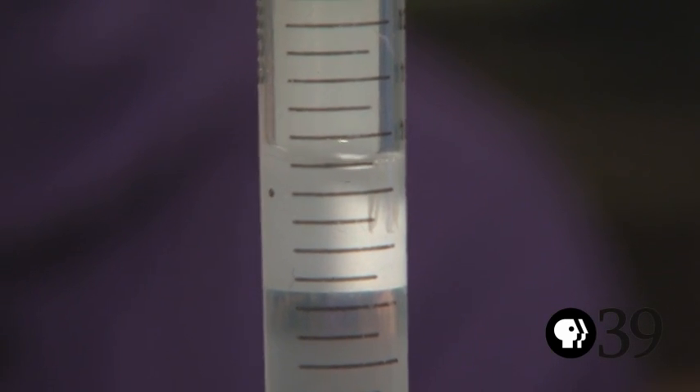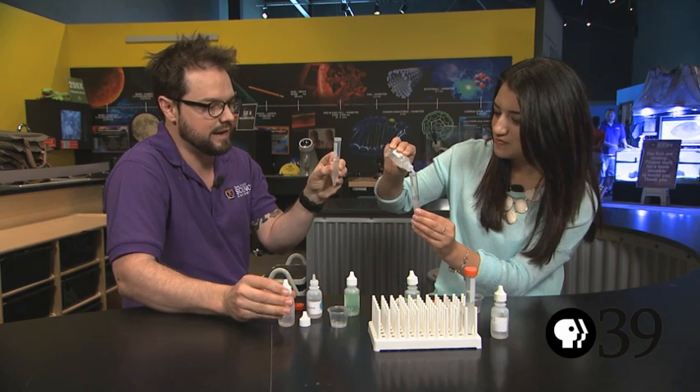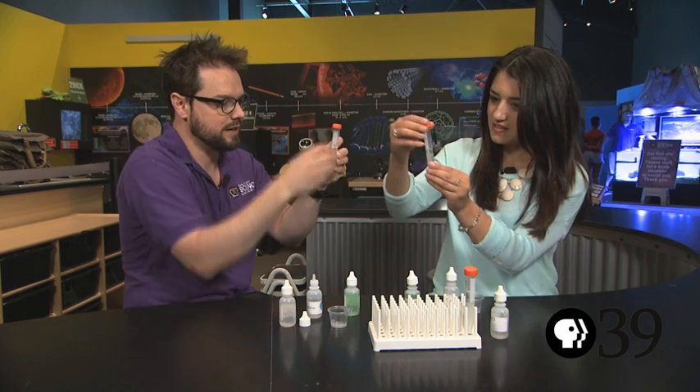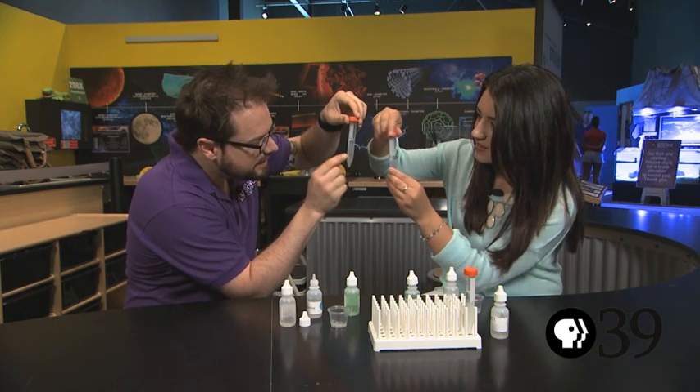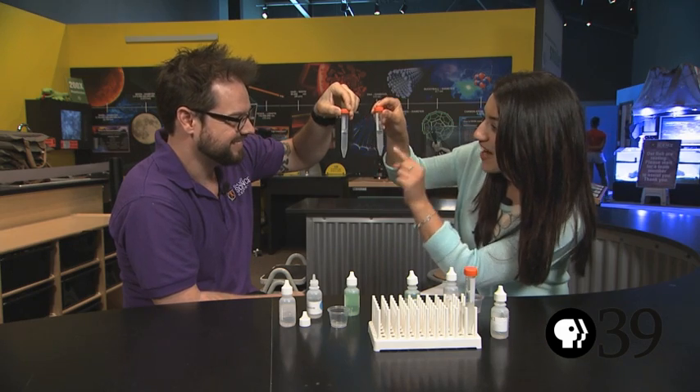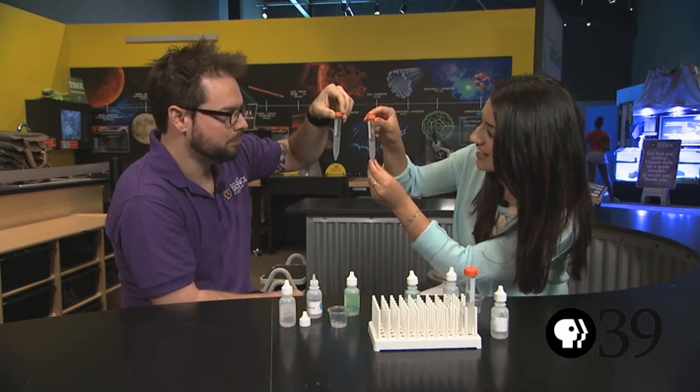That clear layer is alcohol and the cloudy layer on the bottom is our water. Now we don't need to shake it up this time, but we should start to see little cloudy strings moving into the clear liquid, and that's our DNA. Wow, that's amazing. That's my DNA and that's yours — that's the blueprint to build you. I'm taking my DNA with me. That's all for me today for Science Time. I'm Brittany Garzillo.